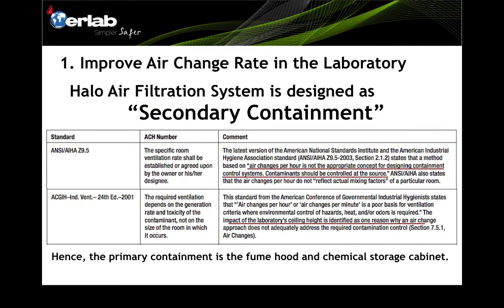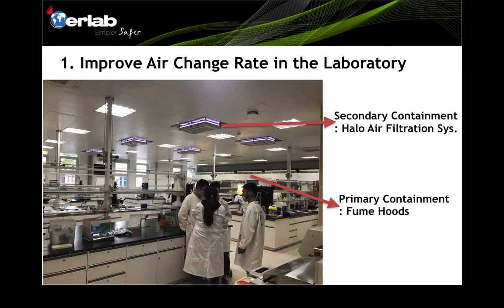One important point to emphasize: the Harlow air filtration system is designed as a secondary containment. The emphasis should go to primary containment first — examples of primary containment are fume hoods and chemical storage cabinets, where vapors are generated inside. Harlow serves as secondary containment for when vapors escape into the room, further removing VOCs. In a typical laboratory setup, fume hoods serve as primary containment and Harlow as secondary, improving room air quality and comfort for workers.